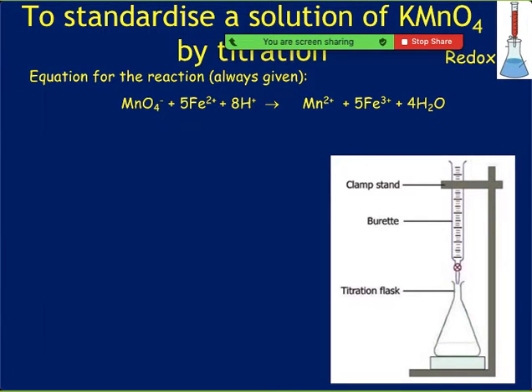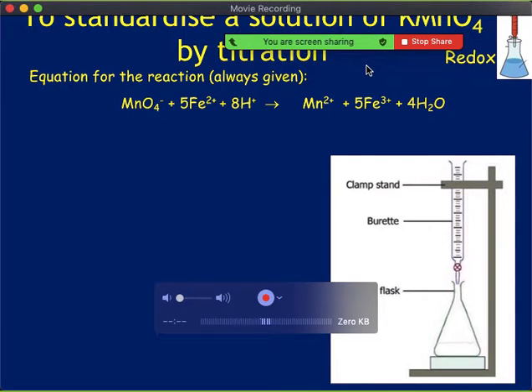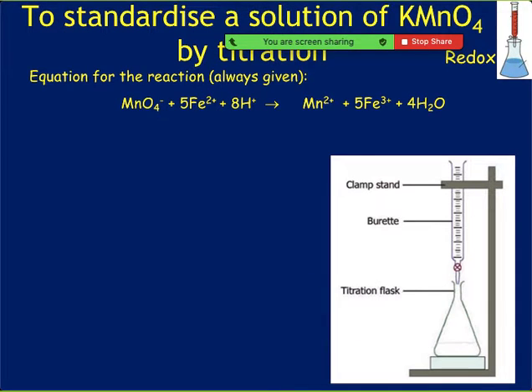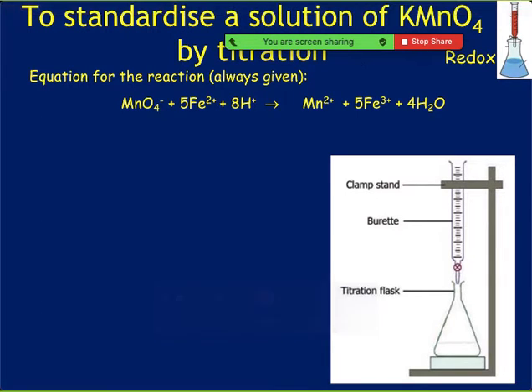Okay, thank you. So if you just flip over to page 126, where the little picture is. What's the grey one? The grey one is the protection of iron 2. So you want to prevent oxidation of iron 2 to iron 3. So that goes with the ammonium. With anything containing iron, we add dilute sulfuric acid. So we add it as we make our solution. They love to ask that question: why did you put sulfuric acid into your beaker before you put your crystals in?